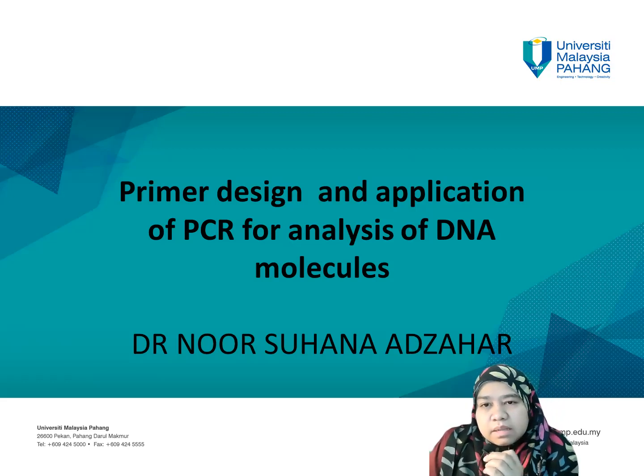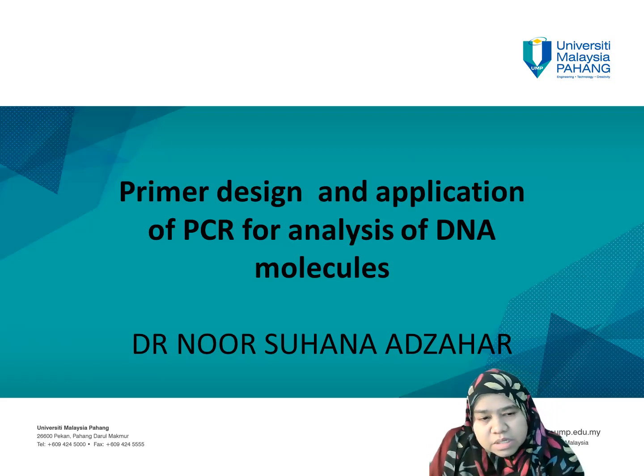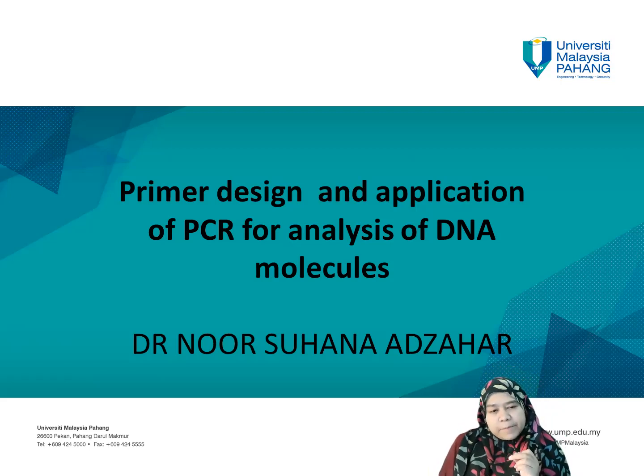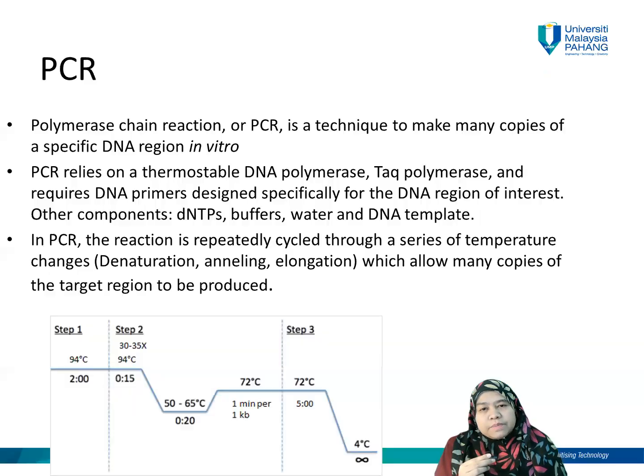Okay, the title given to me for this slot is primer design and application of PCR for analysis of DNA molecule. This topic we have discussed or touched on in the cell and molecular biology course as well as the gene technology course and lab. So this is just a revision for you to recall what we have learned.